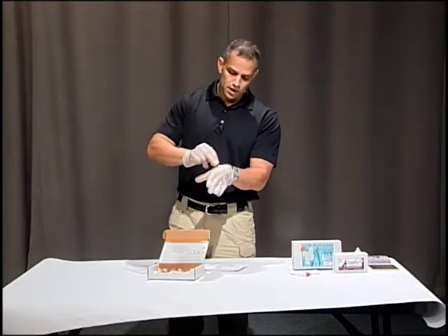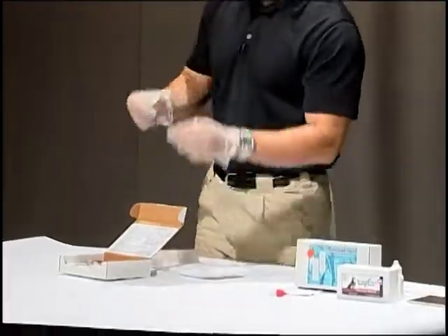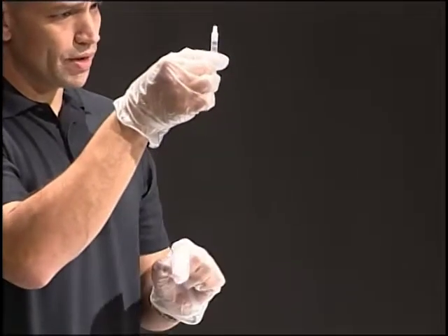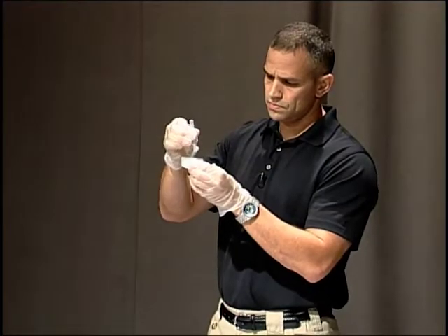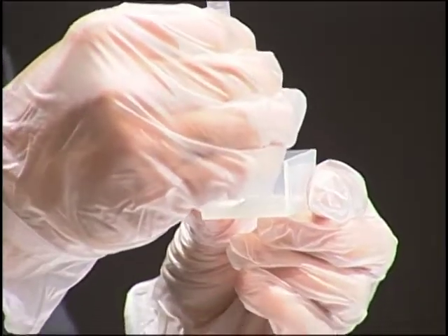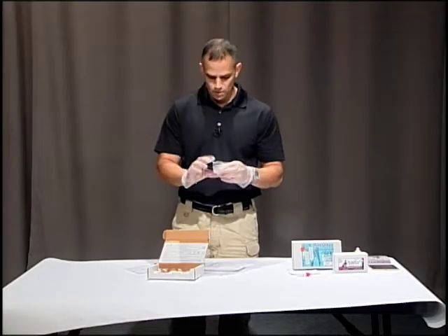We're trying to test for nitrocellulose. We want to make sure we wipe the hand thoroughly. It's important that the swab stay dry — if the hand is wet, you're going to have to blow on it to dry it. Once we do that, we put the swab in the little container, then break the ampule inside the dropper. Make sure the dropper is pointing up when you break the ampule — just squeeze it to break it, then drop the liquid to wet the cotton swab.